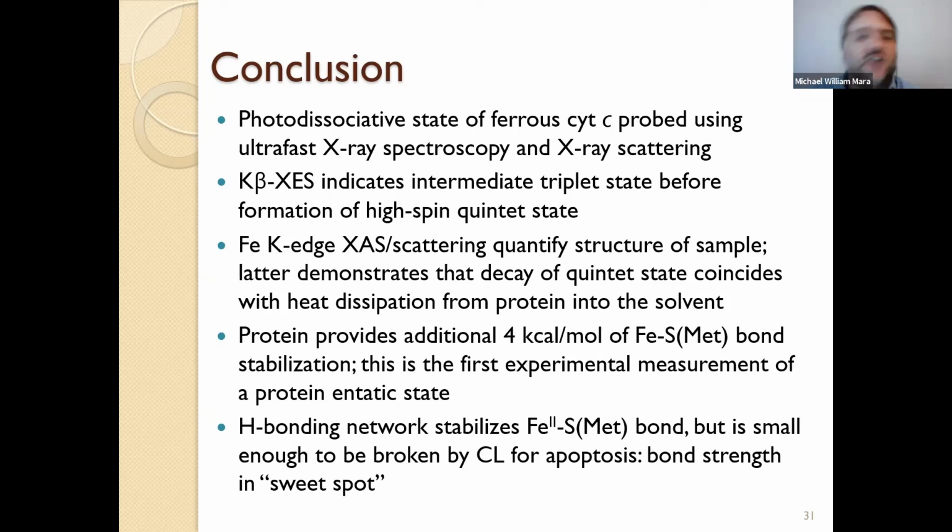The issue that will come up, assuming that you have the same fluence per shot, is that you'll probably destroy your sample a lot faster too. So this may now require a much larger sample environment. The nice thing with the low rep rate in our case is that even if you do destroy sample, it takes you quite a long time to actually reprobe the destroyed sample. So in your data, you never really see a buildup of decomposition product. But with a high rep rate, that will most likely start to become a problem.